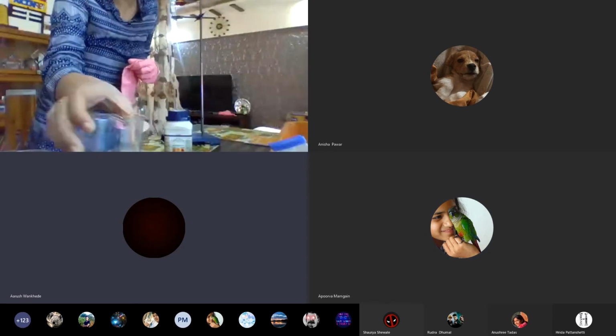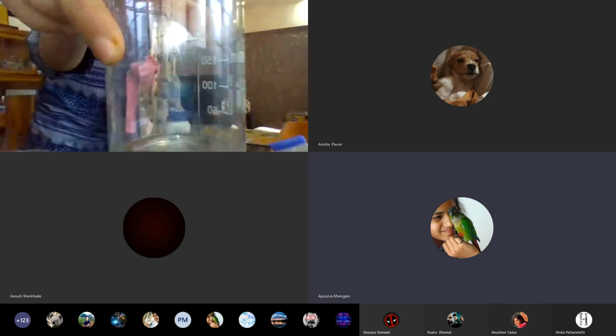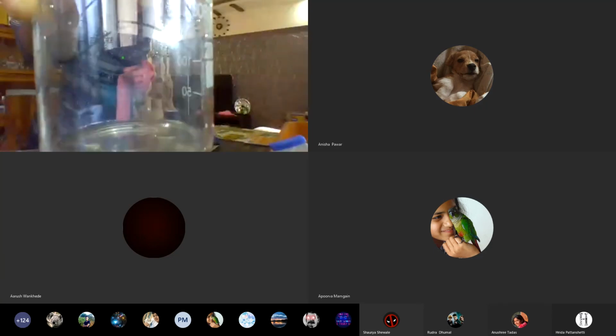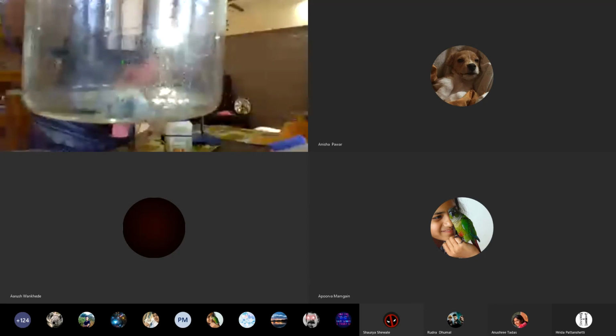Hello. You can see here. Yes, ma'am, it is visible. Sodium reaction, and the reaction is violent. Now, some sodium is actually covered with paraffin.